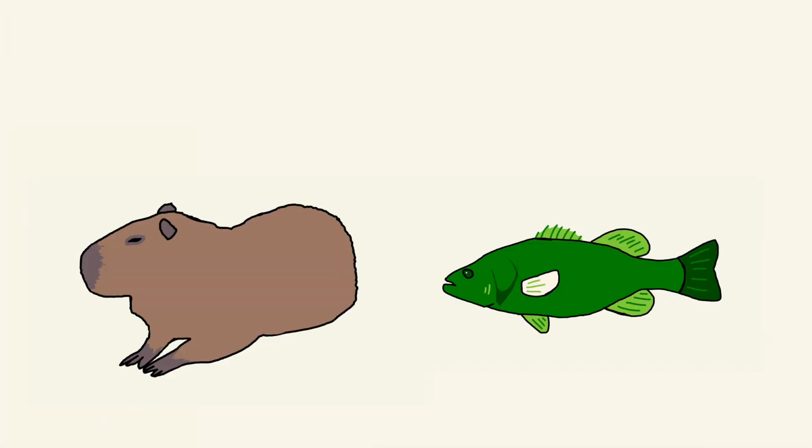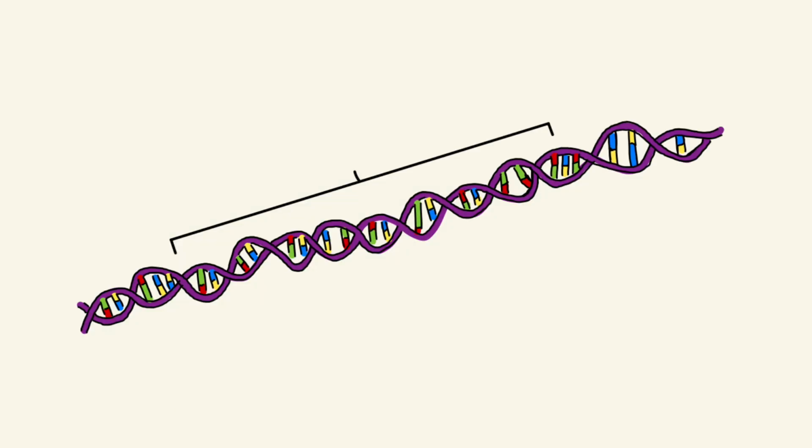However, most of the time, you can identify a species based on just a short DNA sequence, known as a DNA barcode, which ranges from 400 to 800 base pairs long. These sections contain high genetic variability and are easily amplified, allowing them to be practically examined and used to determine the classification of a species. But how exactly do you use these barcodes to identify the species?